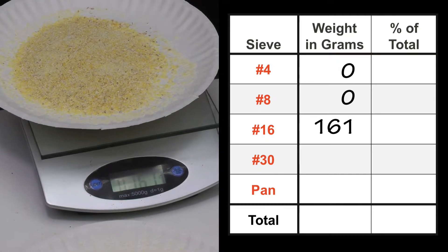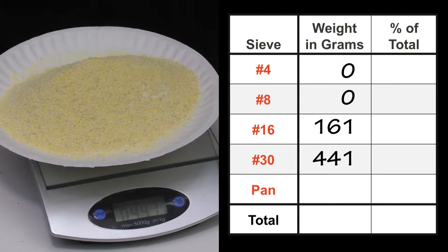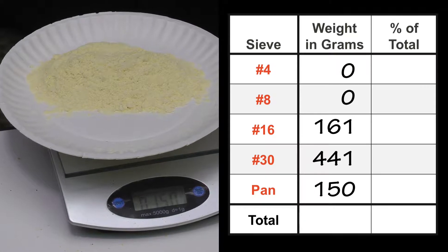We weigh each of the fractions: 161 grams on the third screen. There was nothing on the second and first screens. The fourth screen weighs 441 grams. And finally the last screen — the pan — weighs 150 grams.